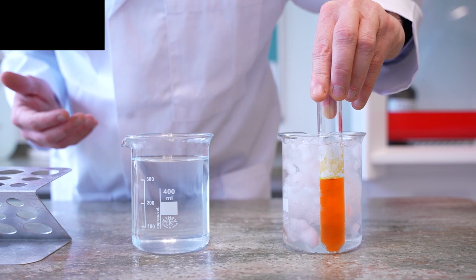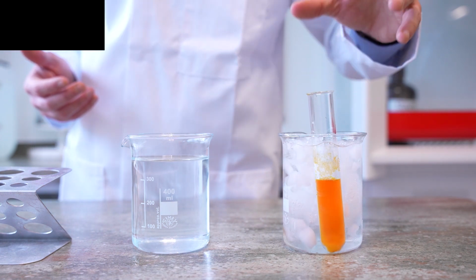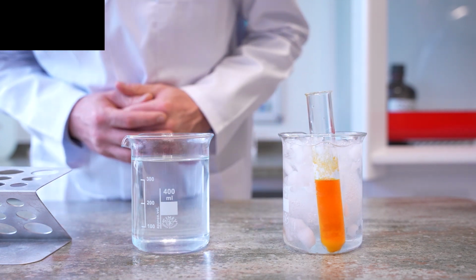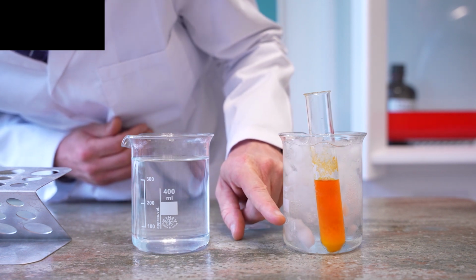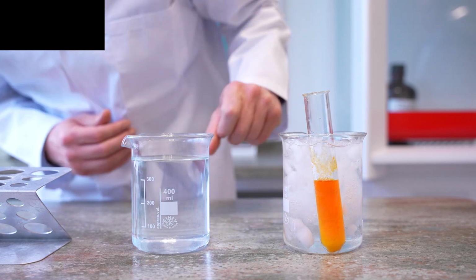This should happen almost straight away. You put it straight into the ice bath, and that should mean that the product will recrystallize out and the impurities will stay in the solvent. And you can see that here, you can see this solid material falling to the bottom of the boiling tube.